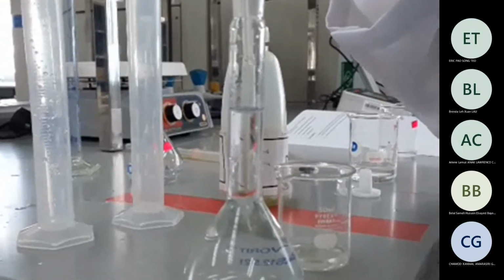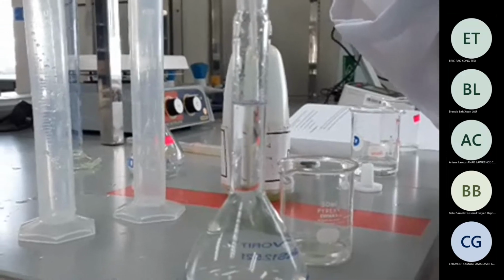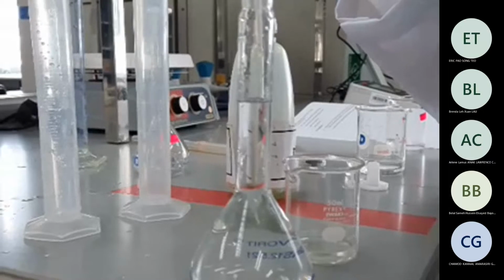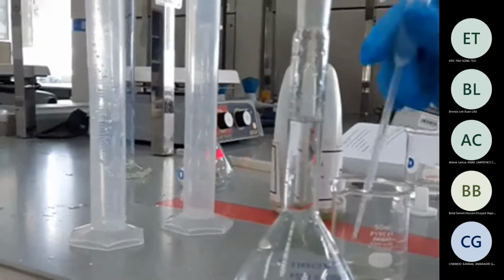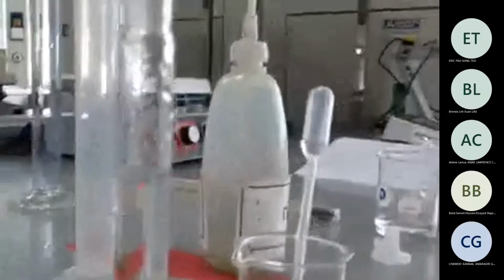Yeah, you need another 2-3 drops probably. 1, 2, 3. Another 1 drop. 1 more. Yeah, done. So we can see that the meniscus is touching the line now. So it is considered done. It is 100 milliliter. All right, good.